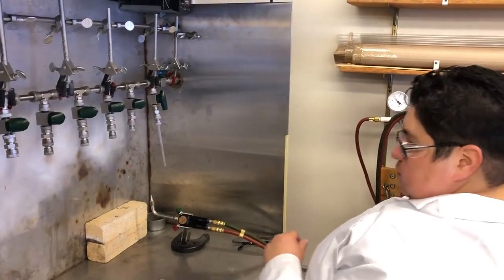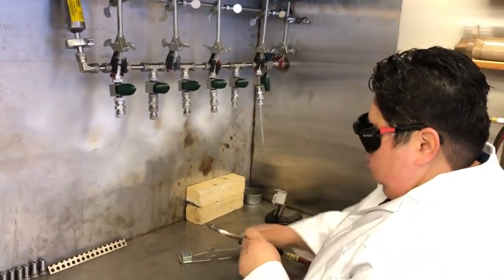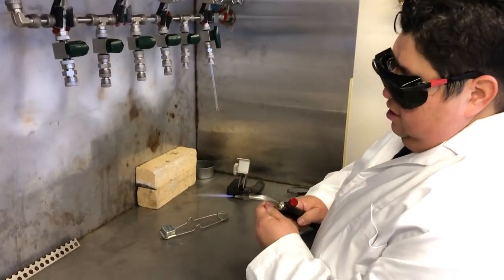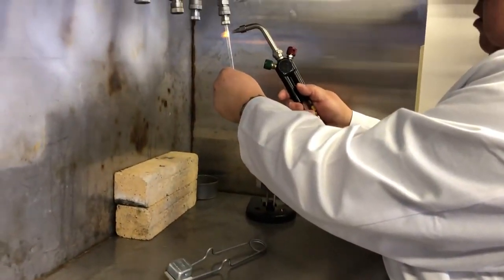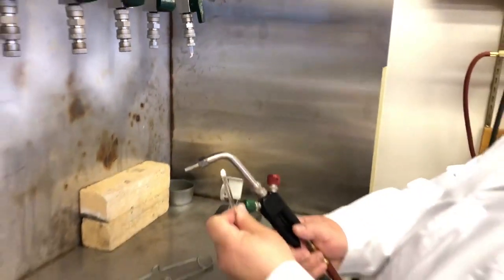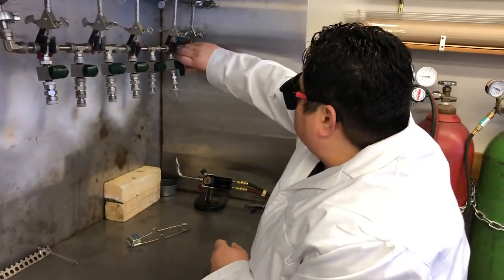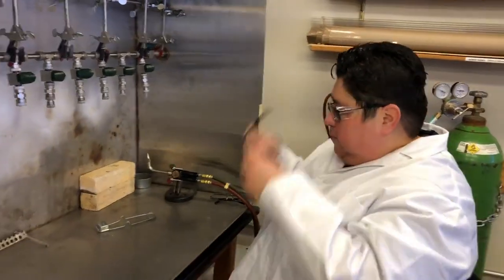Now, for those of you looking on, put on your safety gear, very important. And this goes fast. I'm going to just use my torch here to seal this sample off while it's under vacuum. And voila. Safe, so we'll get our tanks turned off.